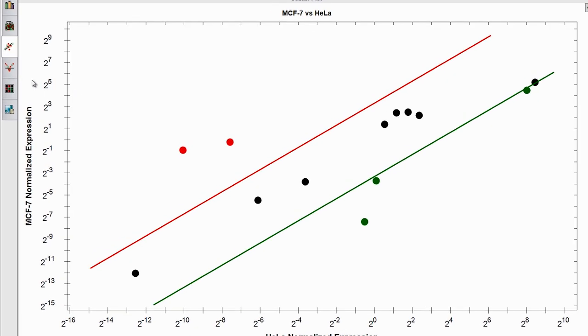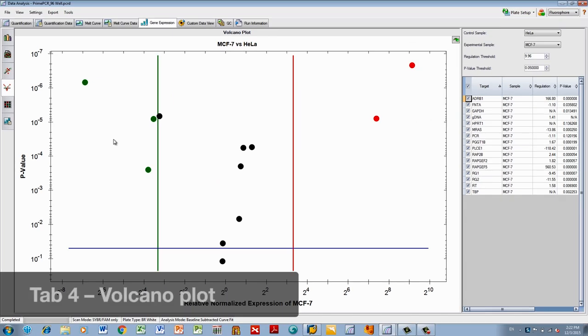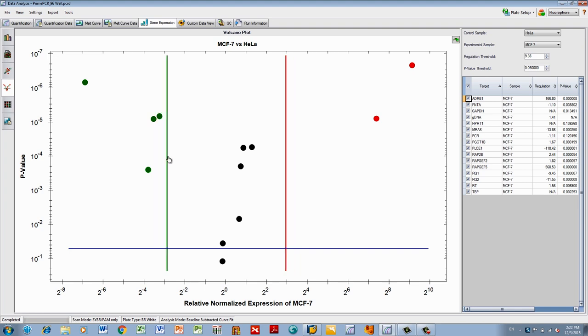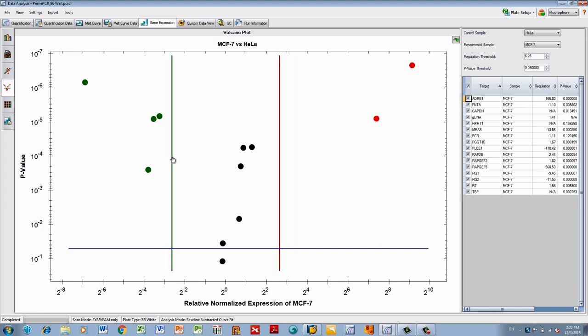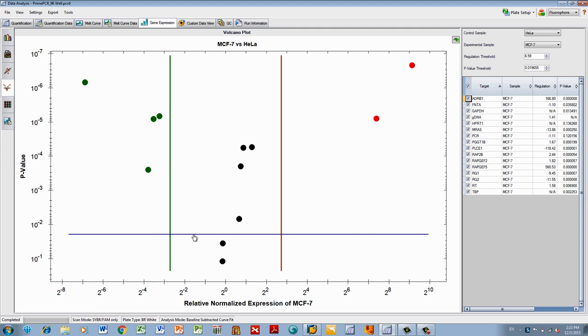Next, the Volcano Plot shows the change in relative normalized expression of a target for an experimental sample to a control and indicates the degree of significance using p-values. The p-value is calculated using any replicates that have the same target and sample names. The smaller the p-value, the more confidence you can have in your data. As with the Scatter Plot, the threshold lines can be changed by dragging them.